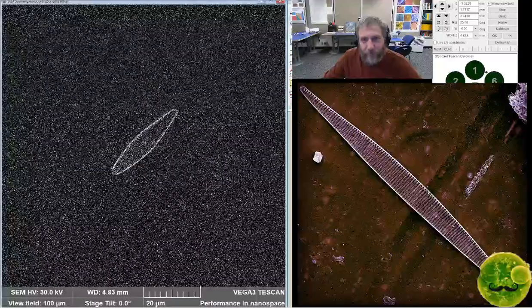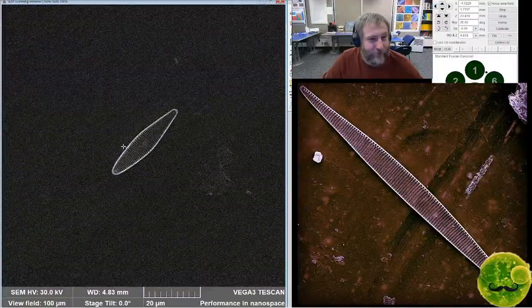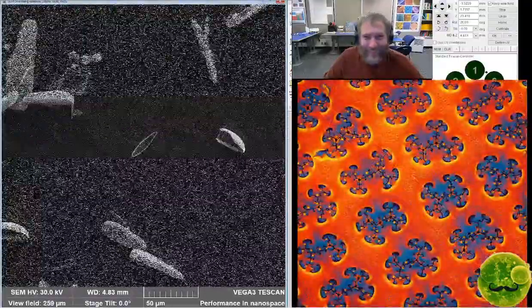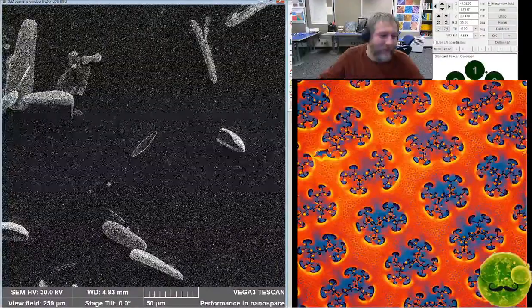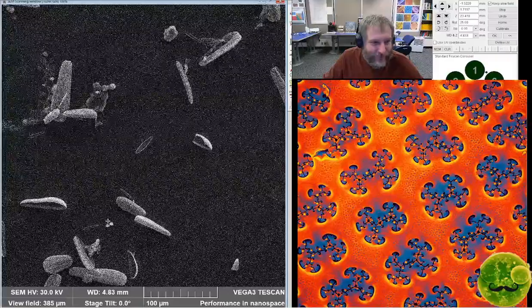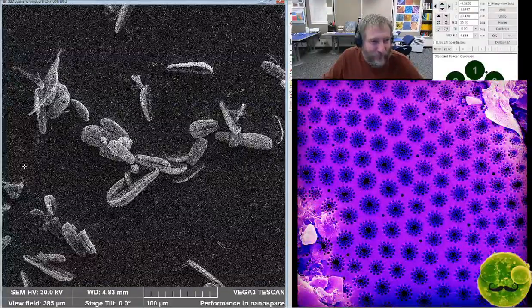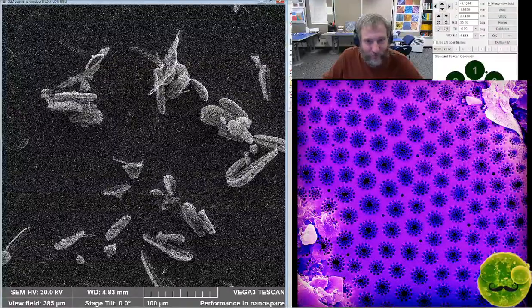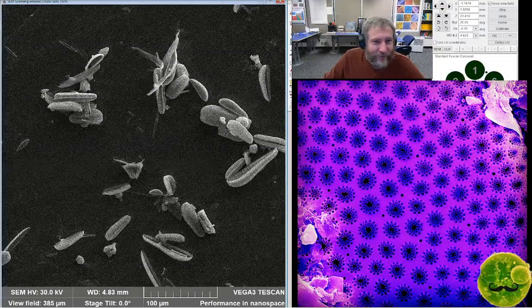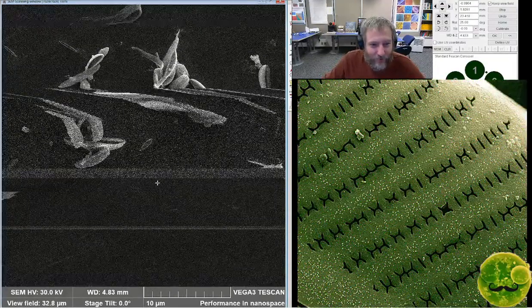CF is what we use when we don't know what it is, basically. We know what it isn't. That's basically science's way of saying, I don't know. It probably isn't tanganyikae, but it's something, and I don't know what it is. So, some kind of a mystery. This might be a small version of it.